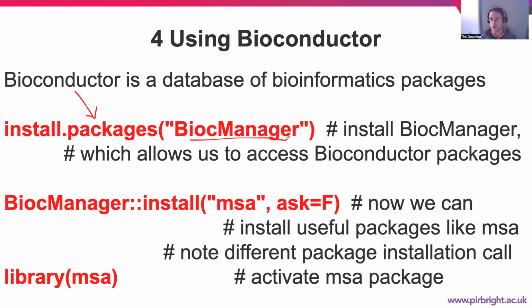Previously, BiocLite was a different nickname that was used to refer to Bioconductor. So you may find code on the interweb with BiocLite written in there. Don't use that code. It's old. It won't work. You'll need to use BiocManager to run things.